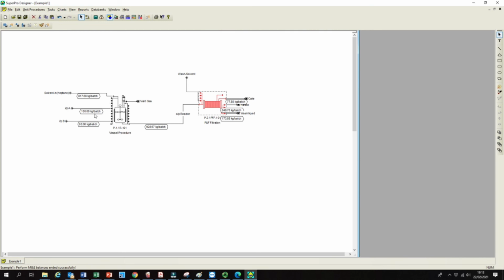It doesn't have to be 100, like 40 kg in or 50 kg of B in. You can change the number, you can change the reaction time, you can even change the stoichiometry, and try to generate a new report, and then put your name, attach it, and append it with your final report.